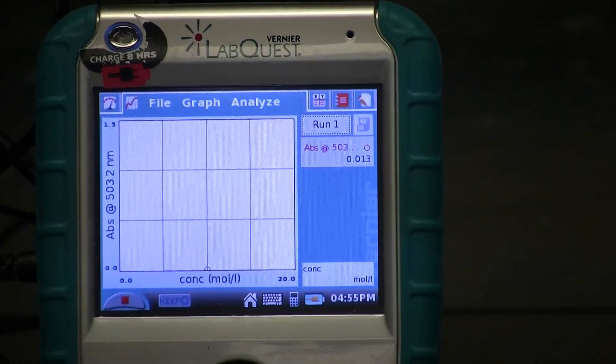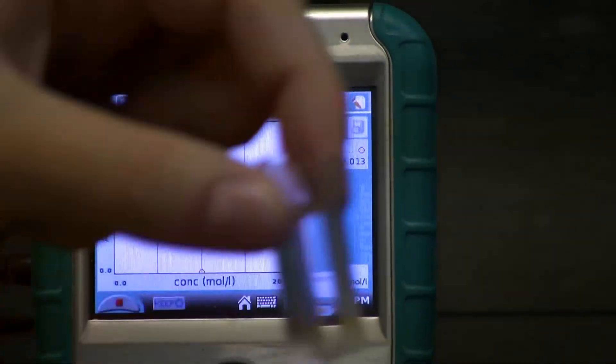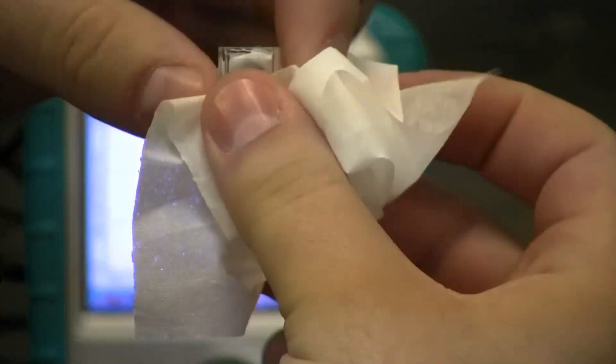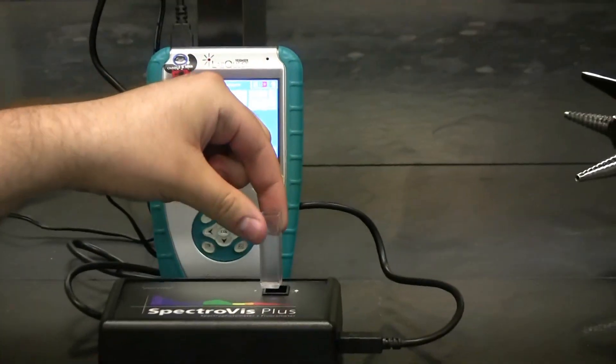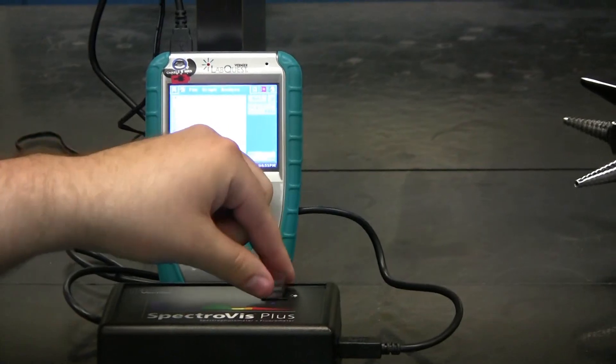You are now ready to take your serial dilution cuvettes, wipe them off one by one with Kim Wipes, and place them one by one into the SpectroVis Plus.